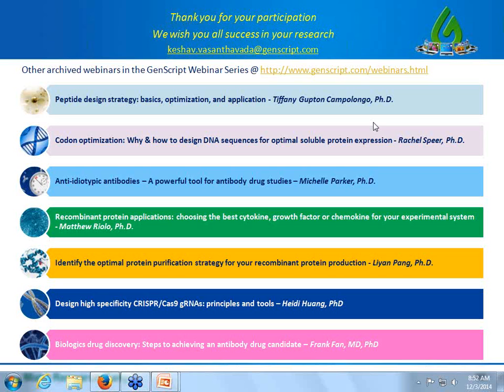Is it possible to predict the optimal expression system for a given protein sequence? Now, that's a good question. I'm not sure if we can predict an optimal expression system. This has to be done empirically, right? So obviously, many people start off with E. coli, just because it's easy to use, and once E. coli fails, they move on to another expression system.